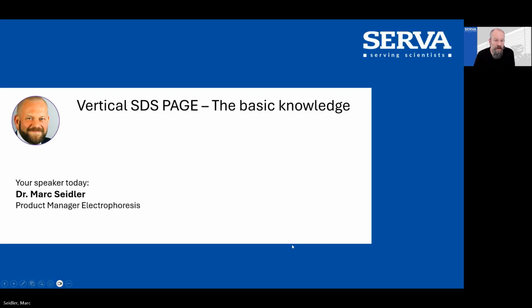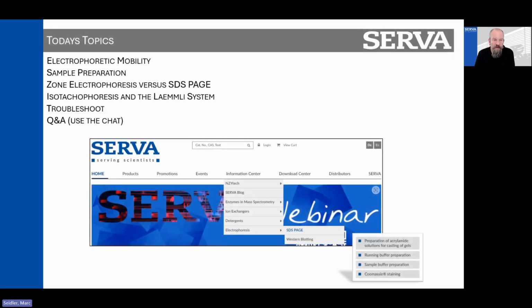The topic of our today's webinar is vertical SDS-PAGE, the basic knowledge. Why is that important? It is important because it answers a lot of questions that may arise during SDS-PAGE. If you know the basic knowledge, then most questions, most problems are explainable. And so these are our topics in this webinar.